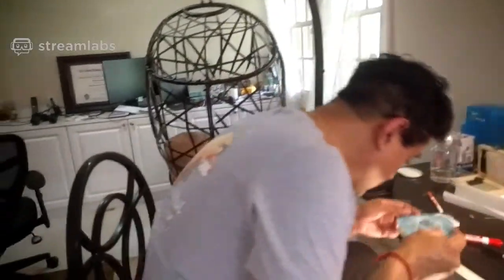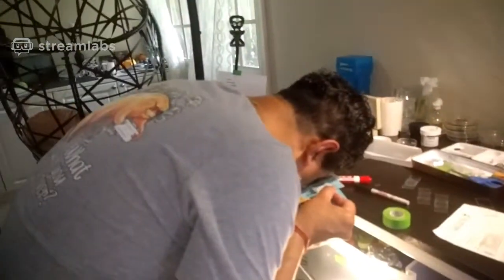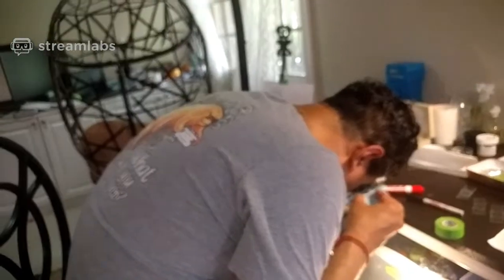Amoebae grow very easily. Again, a couple of wheat grains, amoeba. Sometimes they like other little organisms called ciliates. One such ciliate is Chilomonas. You can culture an amoeba for years with Chilomonas. Okay, then let's try. Let me try to find an amoeba or two here.